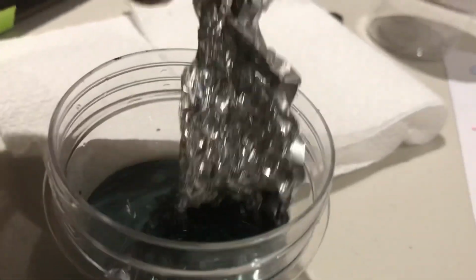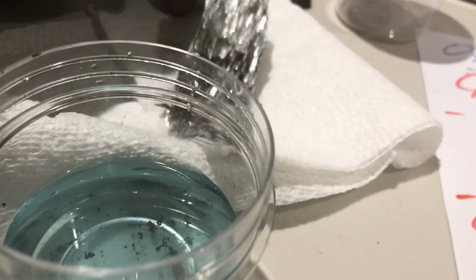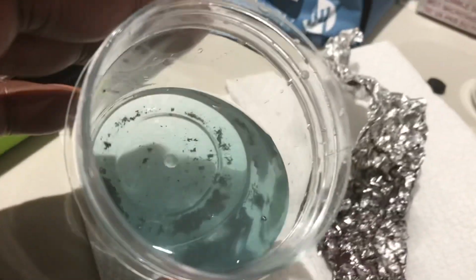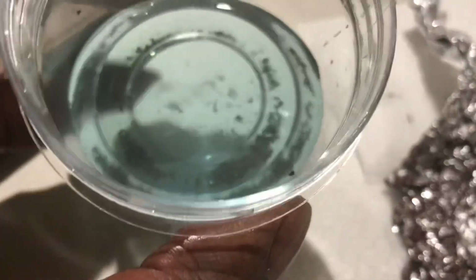So I'm going to put this tissue right there. I'm going to put the aluminum foil there. Bam. And I'm going to put this next to it, so you can see that right there inside, the aerial view. All that stuff in the bottom, guys, is copper.